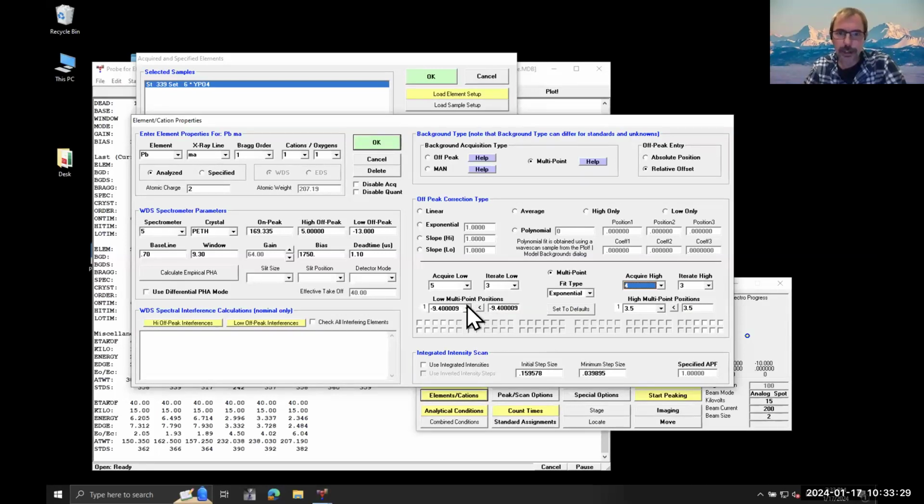And down here, I have my multiple options. So I can choose here my 5 entries. So if I want to modify my point number 3, for instance, I would click on these options, change my background position to 75, let's say, and validate my choice. So this would be the options to set your different backgrounds, same again with the high positions.